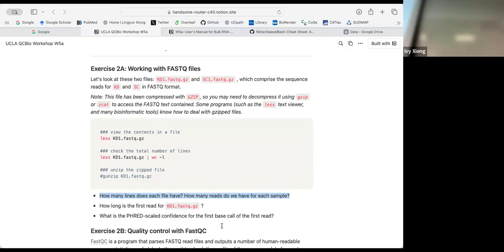So what you want to do is go in there and delete it. It's very strange in here. So you delete this thing and then you copy it. So now you have a folder. So you can copy.